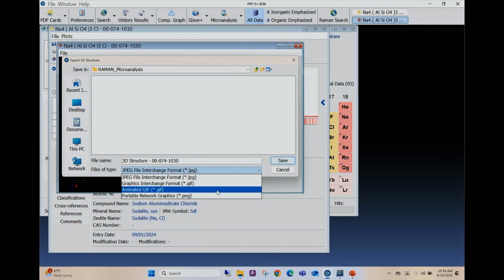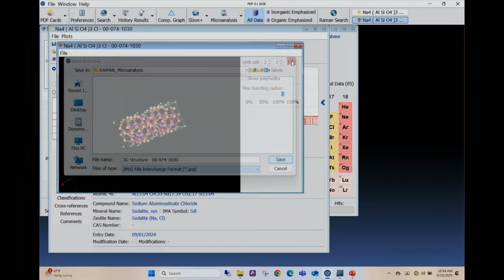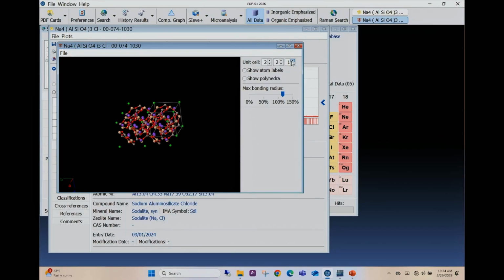If you want to put that circling structure in your slide when you start your presentation, people like, oh, the molecule spinning around, you can do that as well, okay? All right. My personal experience working in an industrial environment is managers love that stuff. They love colors and they love molecules spinning around. Okay, all right. So you have that option with the structure.